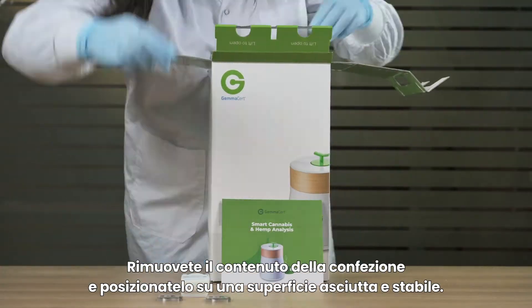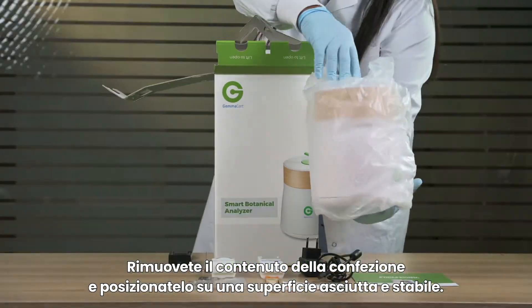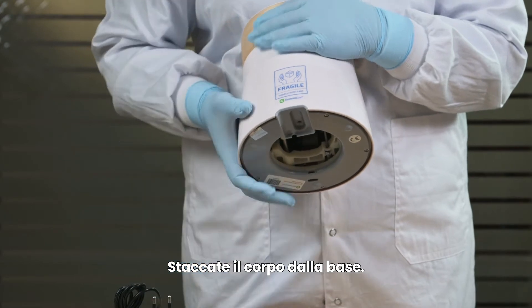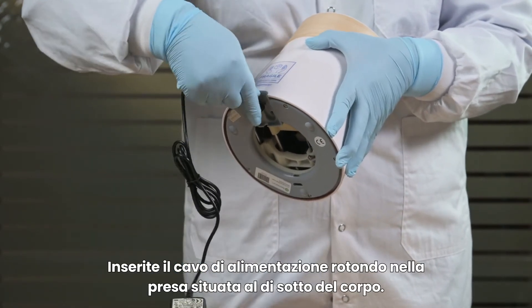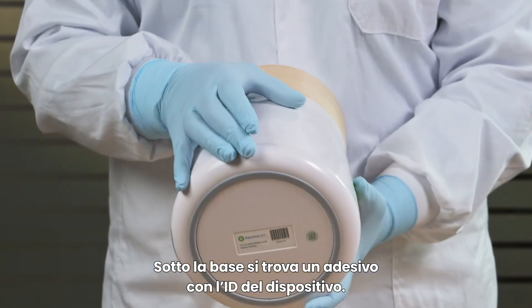Remove package contents and place them on a dry, stable surface. Detach body from base. Plug the round power supply cable into the socket located under the body. Note the device ID on the sticker under the base.